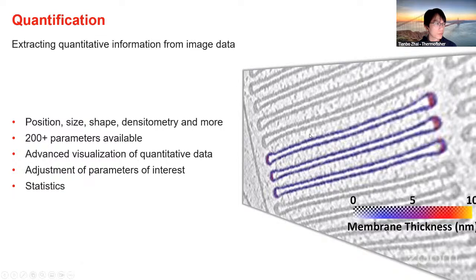So I will also be showcasing one of those cases that we're seeing on the right-hand side, where the thickness of the membranes is being quantified.